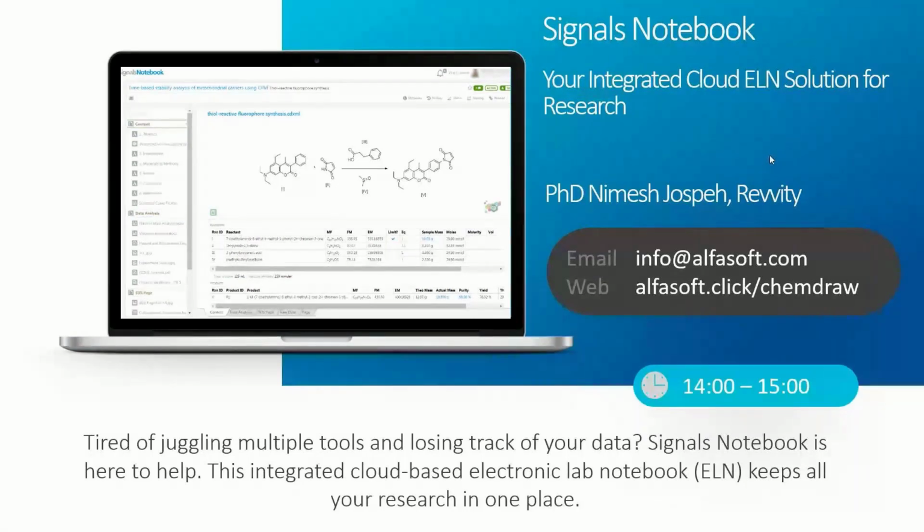Of course, yes. So Signals Notebook is a SaaS solution, and all updates will be deployed automatically to all customers. Users will get an in-app notification about the upcoming and scheduled updates. Usually, the updates are done at a time when the users are not actively using the product.